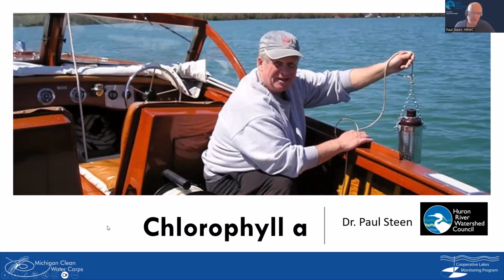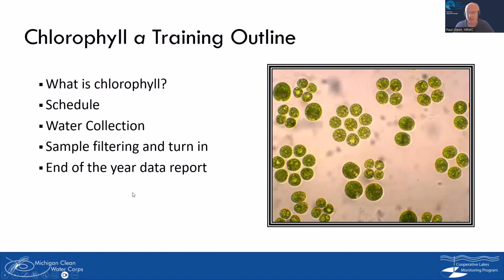And this is the chlorophyll training. Here's what we're going to cover in the next hour. What is chlorophyll? We'll talk about the sampling schedule. We'll talk about the two pieces of the sampling, water collection and sample filtering. And then this presentation is also a good chance to talk more about the data that we will have at the end of all of this, since that's my specialty in the program.